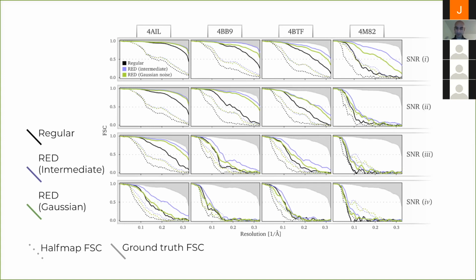Yeah, and you can sort of look at the reference there. Basically, if you combine that with batch normalization, you get currently one of the best state-of-the-art denoisers out there. So that's why we picked that one specifically. Sorry, one more question. Are you adding the Gaussian noise to the 3D structures to serve as the training data sets?